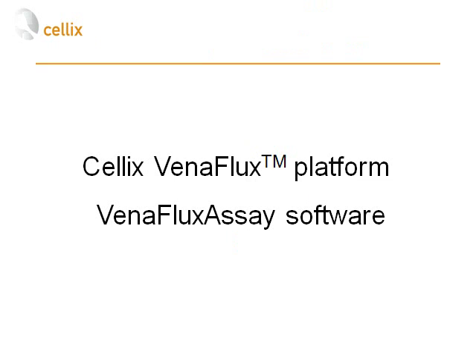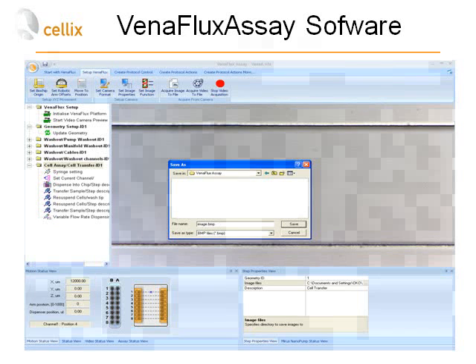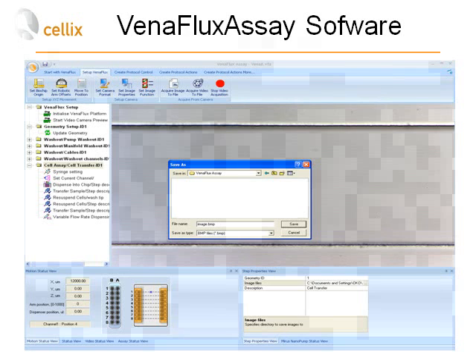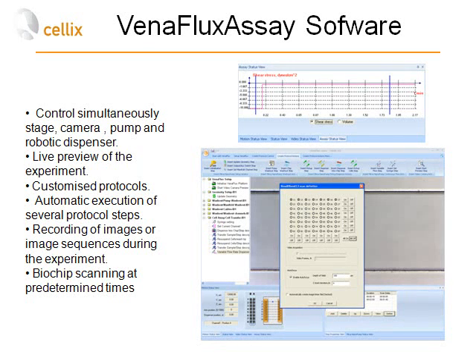The software which controls the VenaFlux platform is called VenaFluxAssay software, and it allows control of all different parts of the system: the camera, motorized stage, pump, and robotic dispenser. This is a typical interface of the program where on the left-hand side you can see the protocol being loaded, which allows execution of different steps of the protocol — for example, syringe settings, setting the current channel of the pump, dispense into chip action, transfer sample, re-suspend cells, and so on. The VenaFlux software allows simultaneous control of stage, camera, pump, and robotic dispenser.